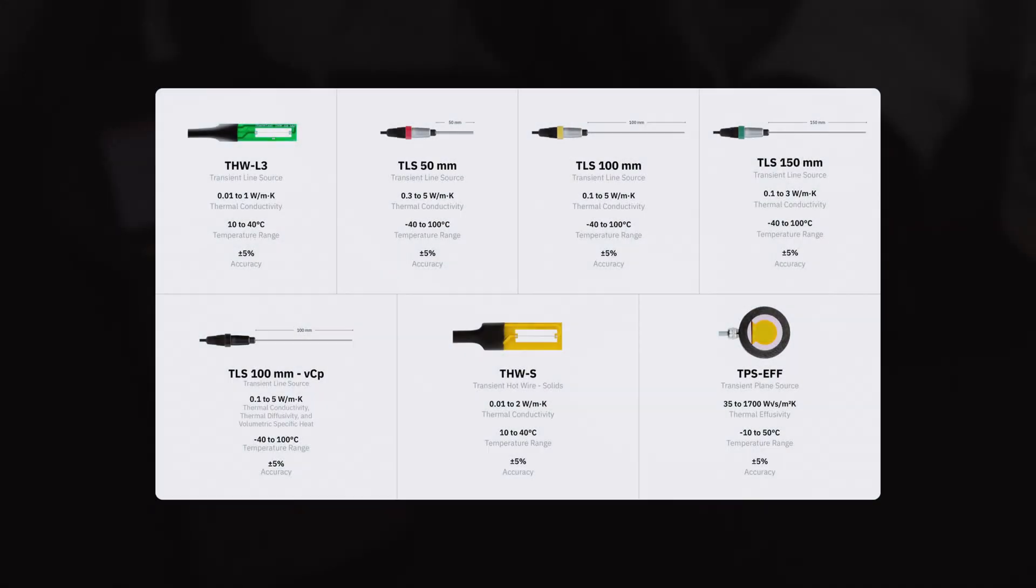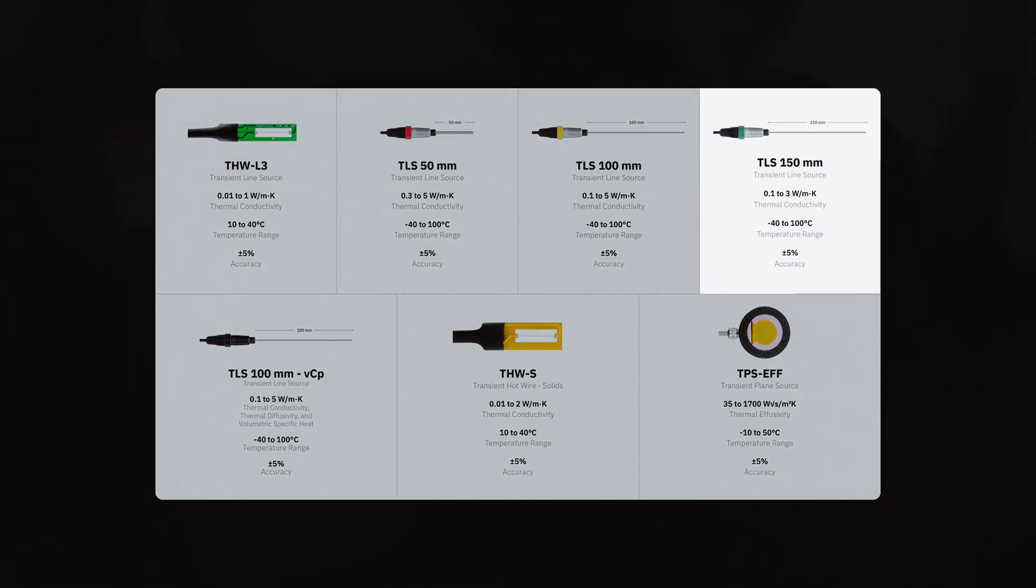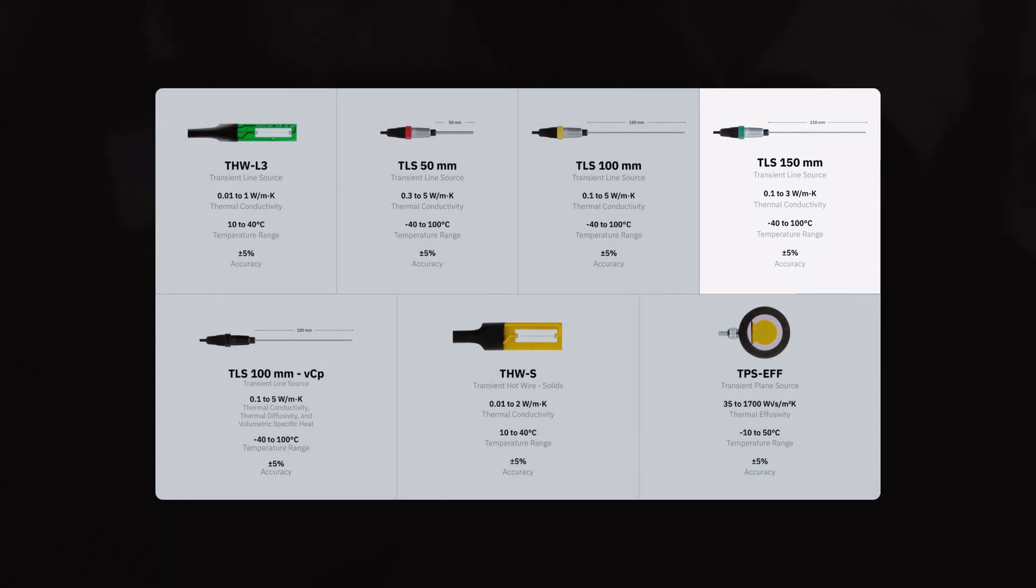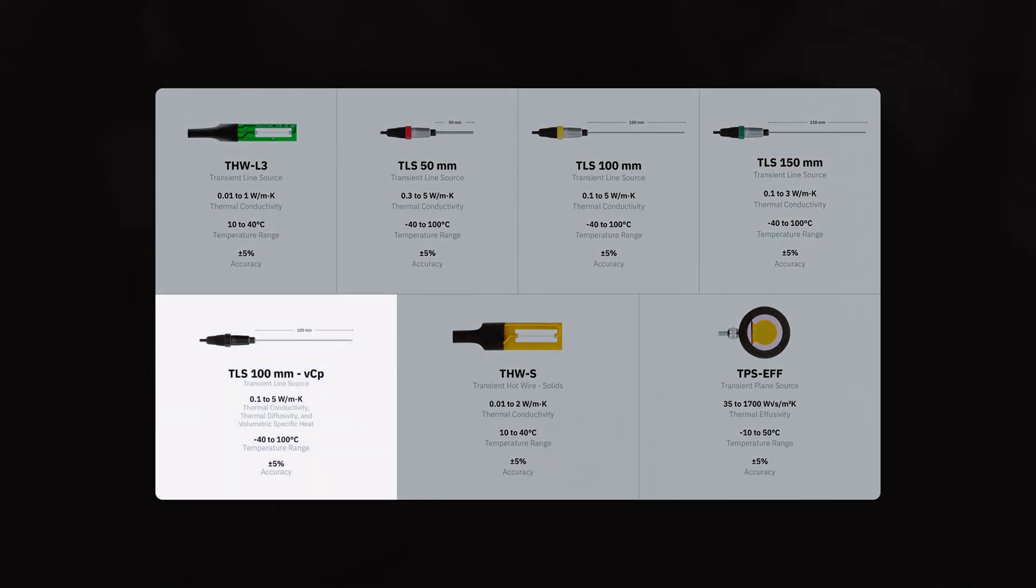Additional sensors which can be swapped out with the MP2 are the TLS 150 millimeter for larger volumes of heterogeneous soil type materials, and the TLS 100 millimeter VCP for testing thermal conductivity, thermal diffusivity, and specific heat of soil or soft, easy-to-drill materials.